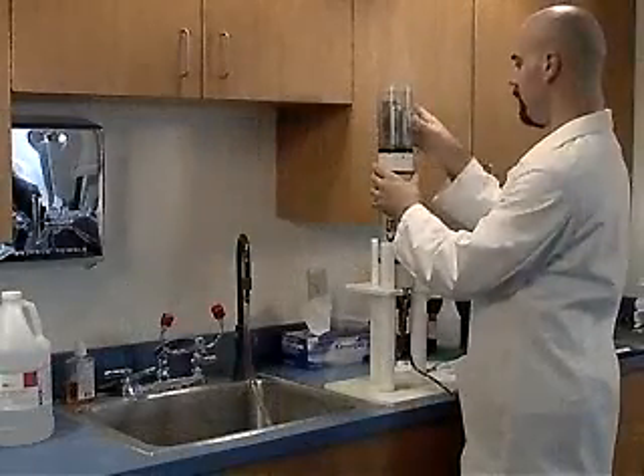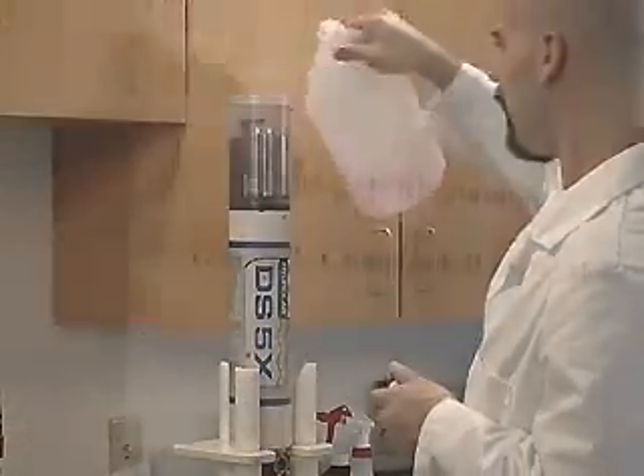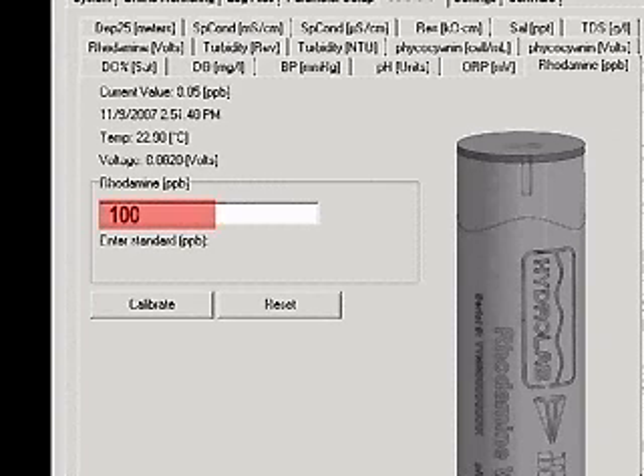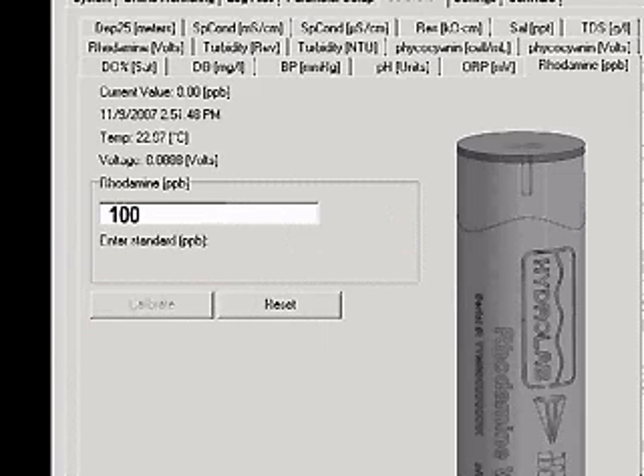Attach the storage cup and fill it to the threads with a known concentration of Rhodamine WT. Wait one minute for the readings to stabilize. Type the value of the concentration into the box and click Calibrate. A calibration successful message will appear. The Rhodamine sensor is now calibrated.